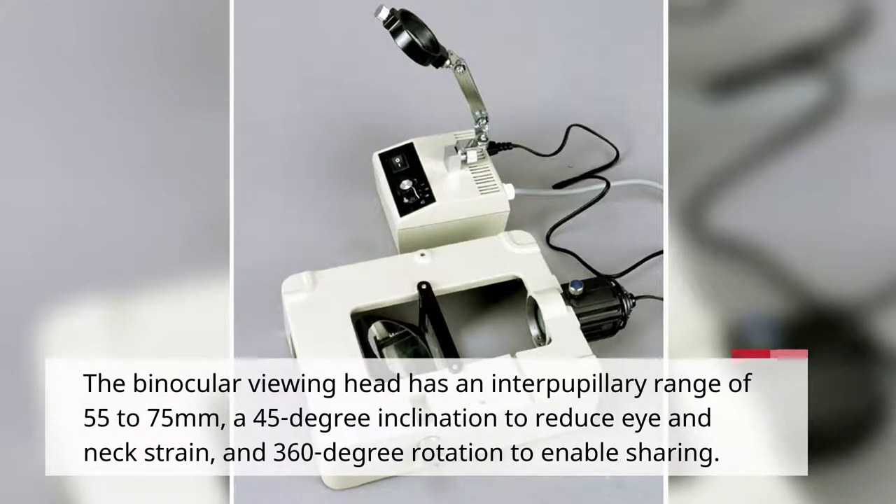The binocular viewing head has an interpupillary range of 55 to 75mm, a 45-degree inclination to reduce eye and neck strain, and 360-degree rotation to enable sharing.